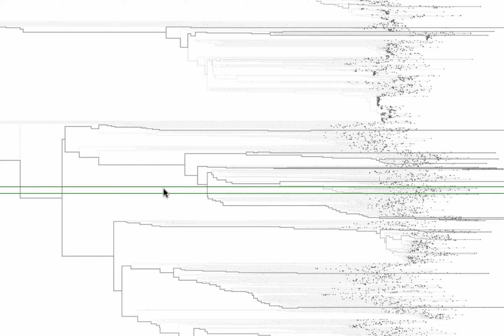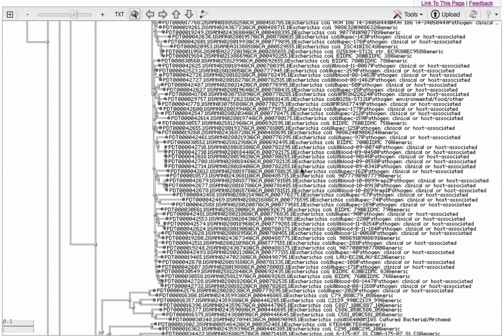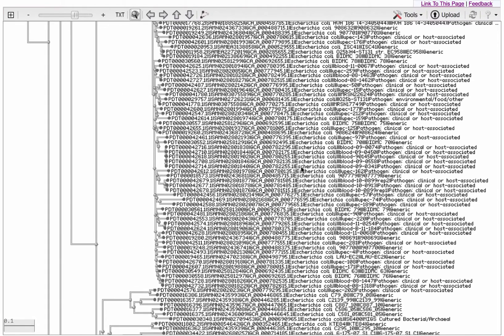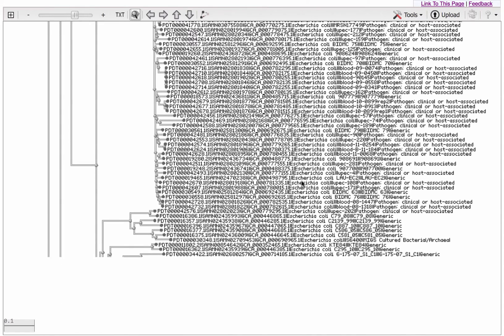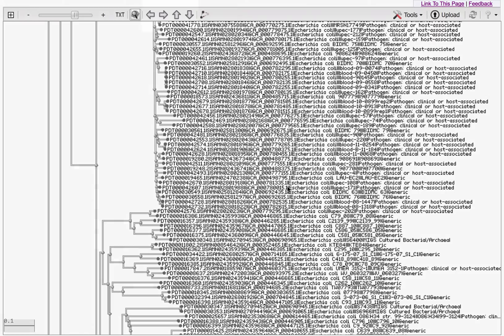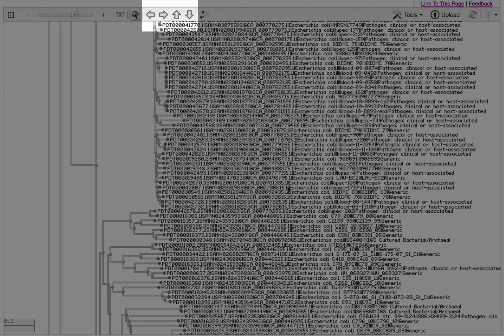Now if I want to see the labels in another part of the tree, I click there. We plan to improve this process of zooming to labels in future releases. Of course you can click and drag the image to move around, or use these arrows.